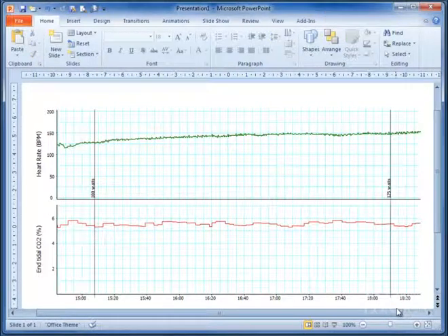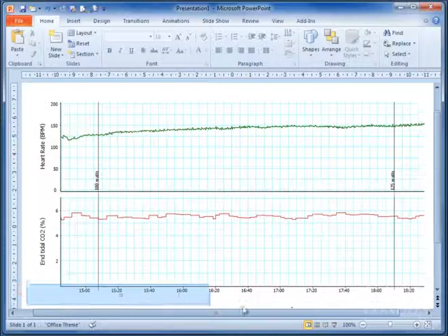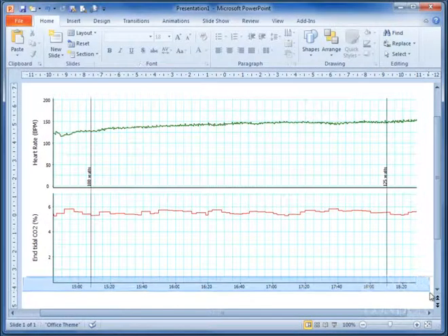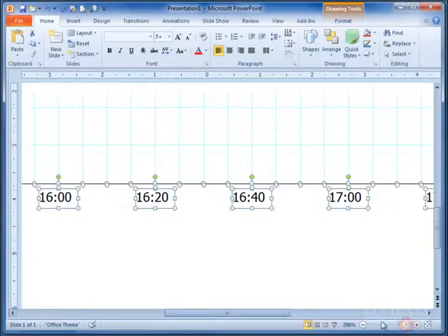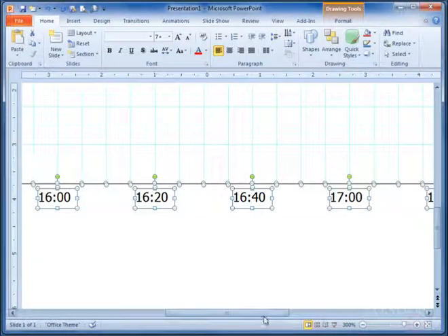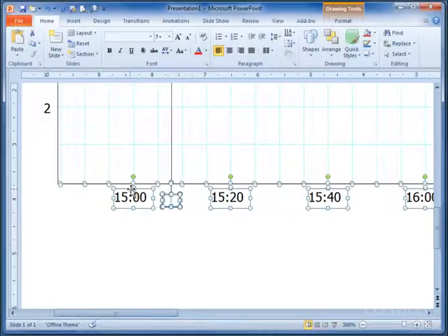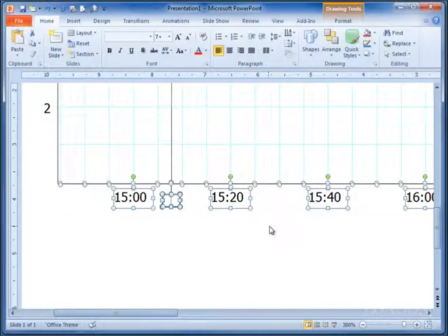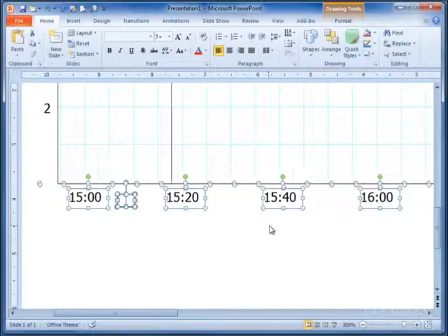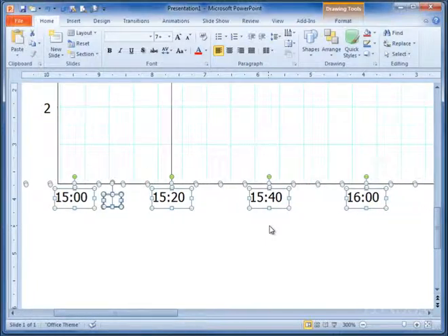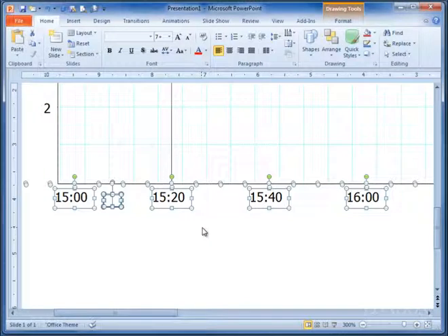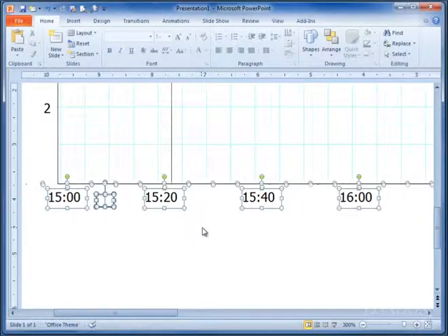And then we can select all of the numbers below this line. Okay, and we can zoom in. So we're going to zoom in all the way over here, and we're going to align the 15, 20 or the 1500. We'll do the 15, 20 to line up with this line. So we just use the cursor key, and we move it. You can see here we're pretty much lined up there, almost exactly lined up.